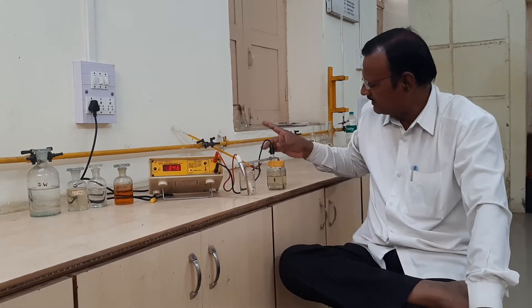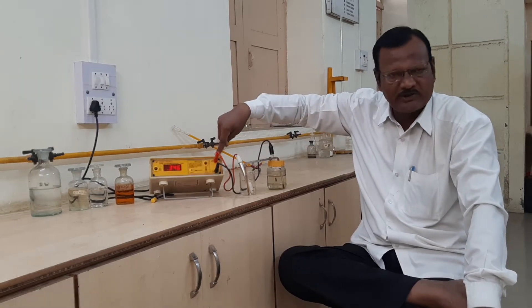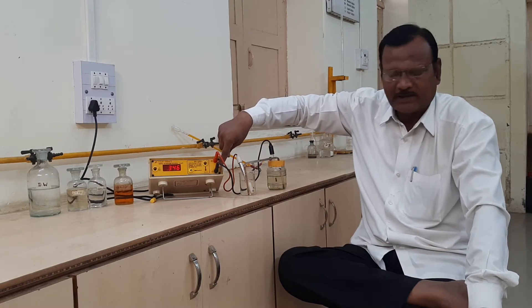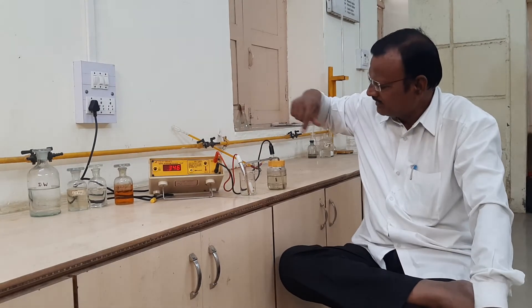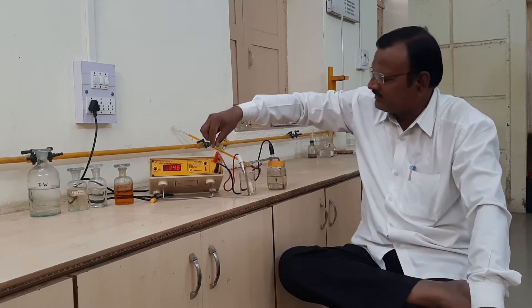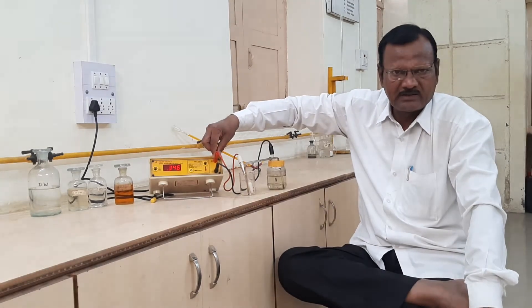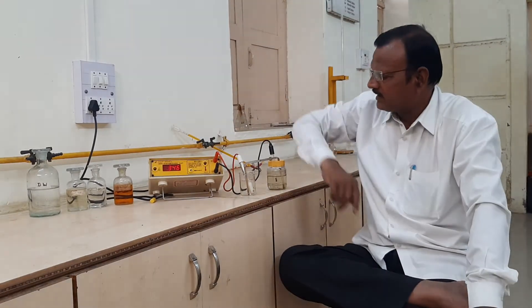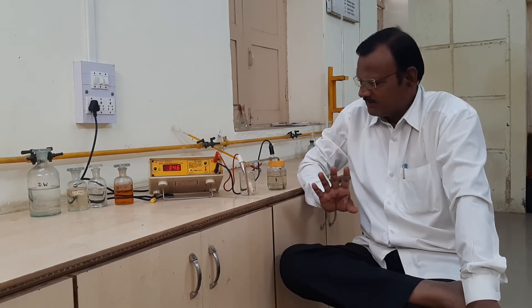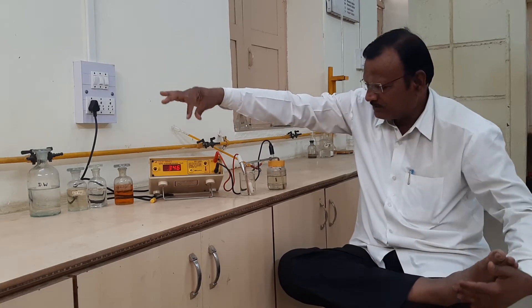In the first half cell, the calomel electrode is connected to the potentiometer at the negative terminal — the black terminal. Then we insert the platinum electrode into the second half cell and connect it to the potentiometer at the positive terminal — the red terminal. Then we observe the reading without addition of potassium dichromate solution.